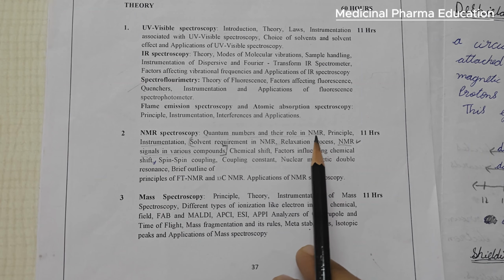Here they gave the formula: delta equals H reference minus H sample, divided by H reference, into 10 power 6 parts per million. Okay, I think you have understood the concept of chemical shift. It is the difference between the absorption position of the proton and the absorption position of the proton of the reference compound. The formula you can see.